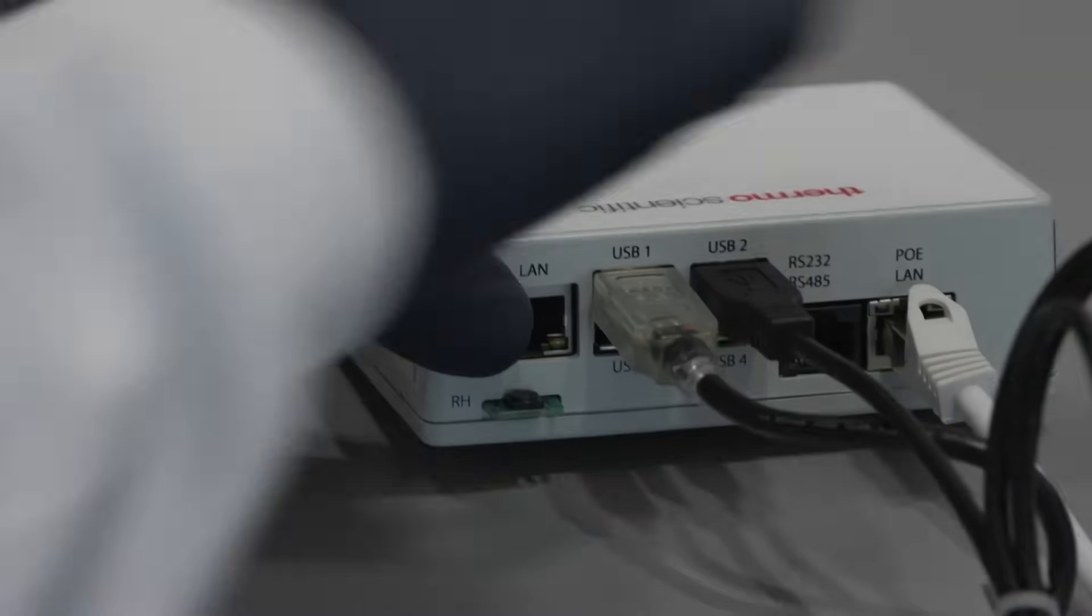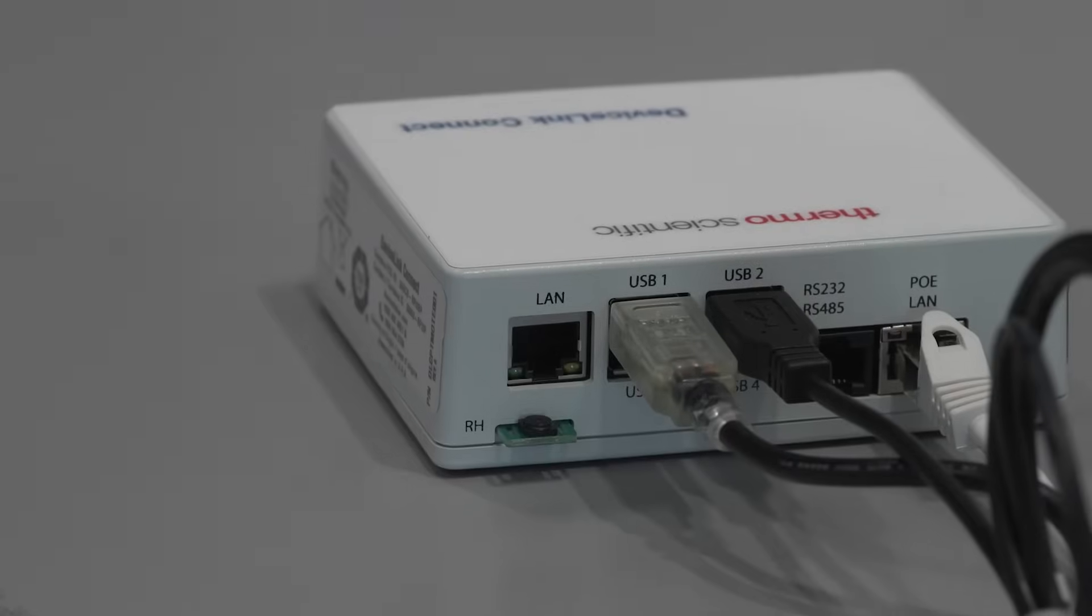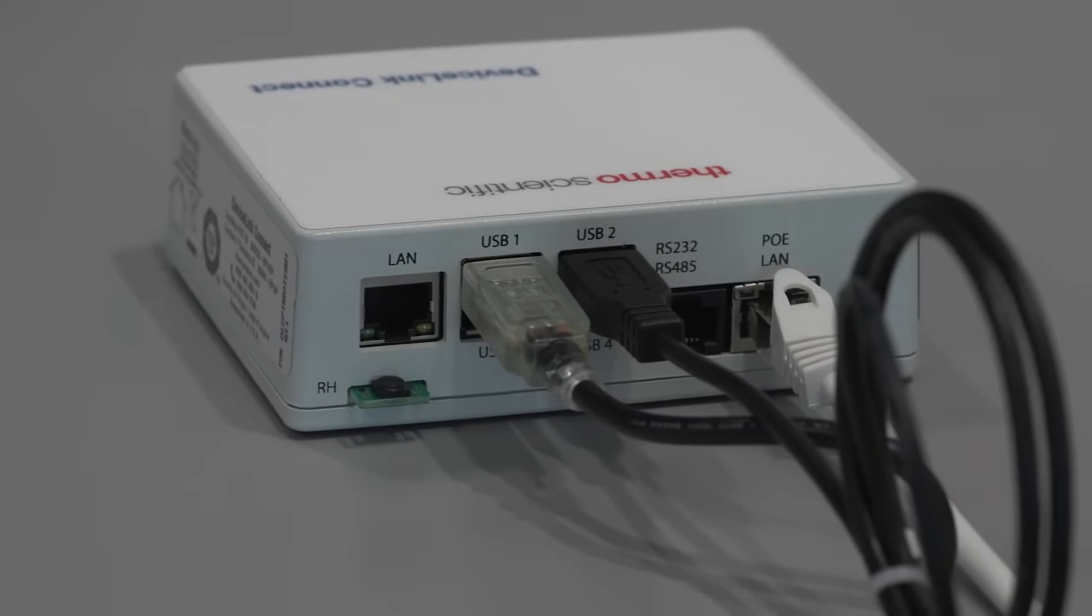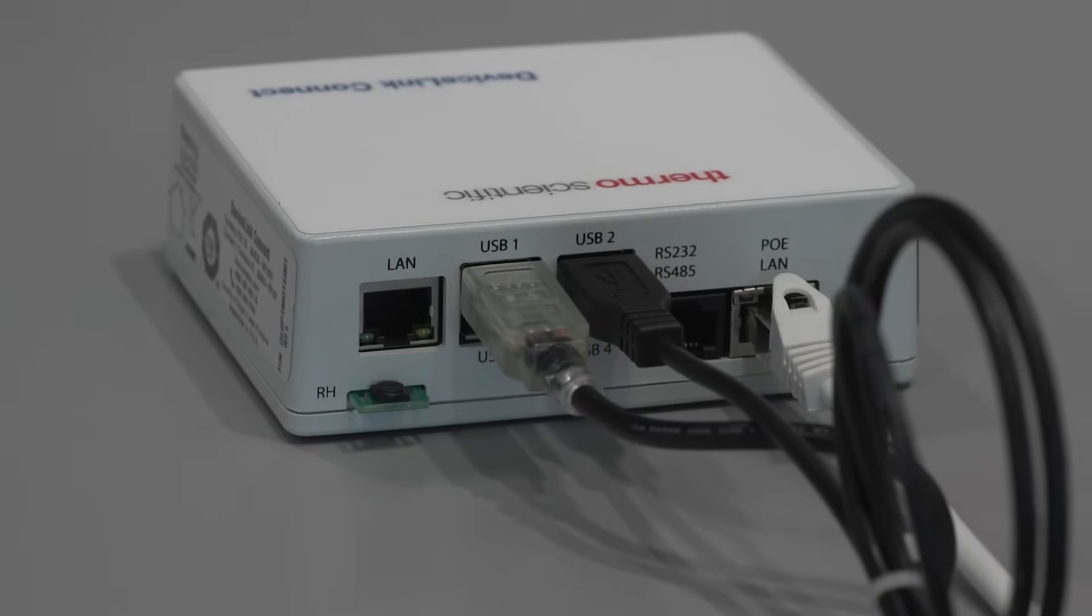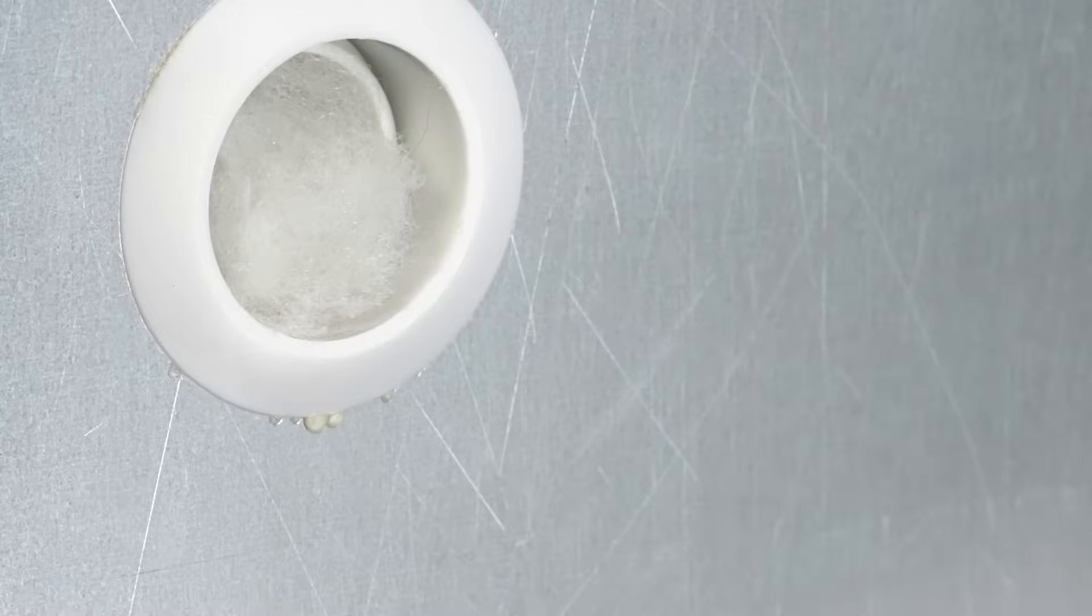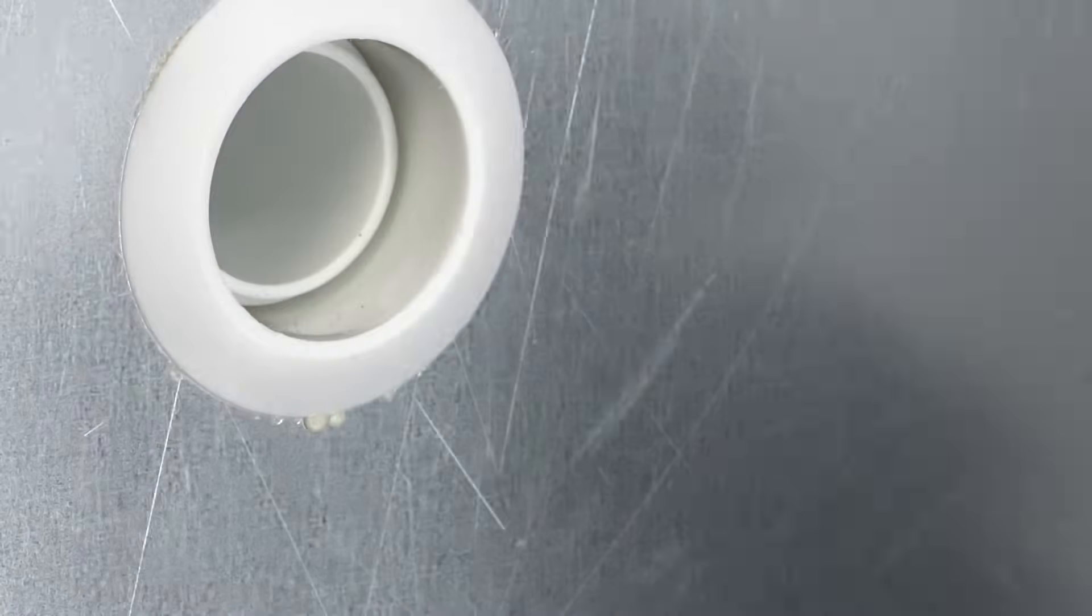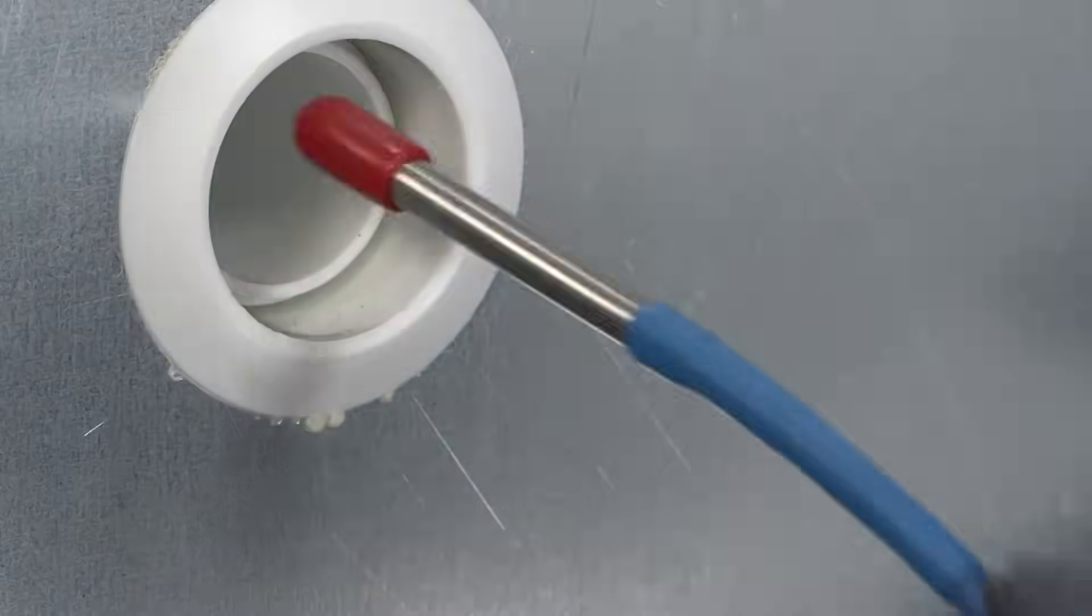Power isn't the only consideration when installing connected solutions to your cold storage products. Proper installation of sensors is critical to minimizing unwanted heat leakage into the refrigerated space.